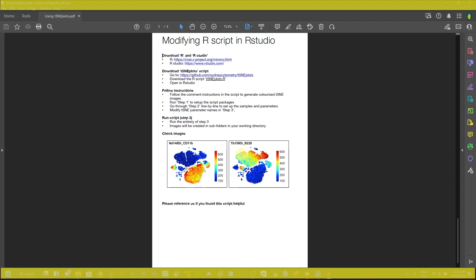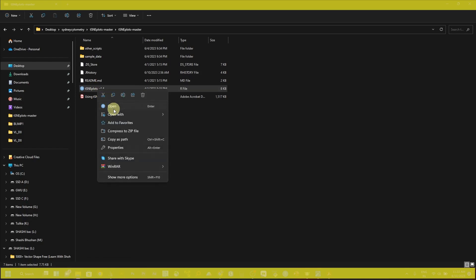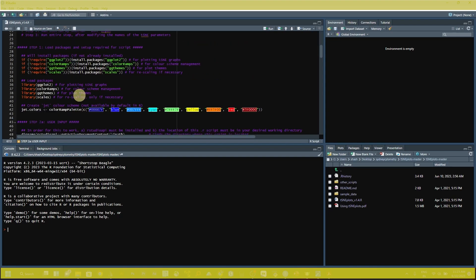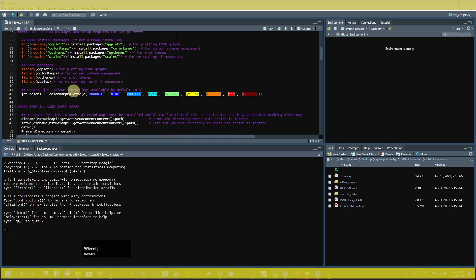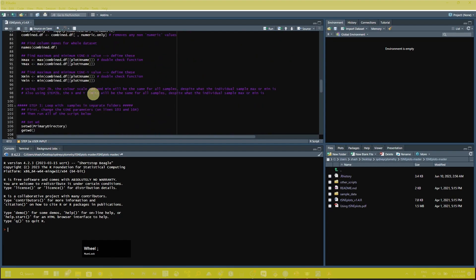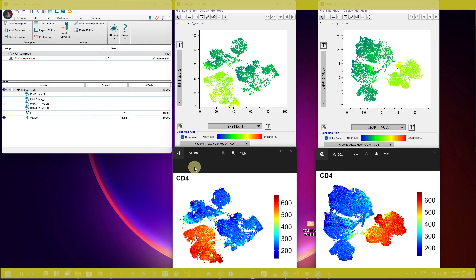If you are using this script in your data analysis, please reference them. The second file is the R script. If you open it, you can see they have given all the commands and information about how to use this script. I will show you how you can use this script to transform your t-SNE plot as well as UMAP plot.